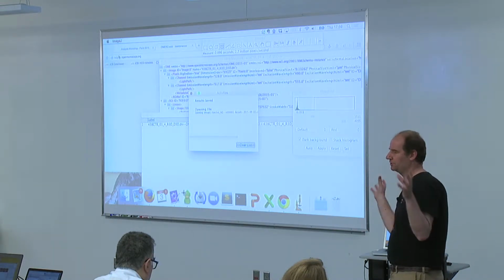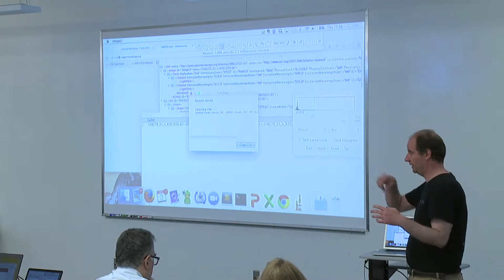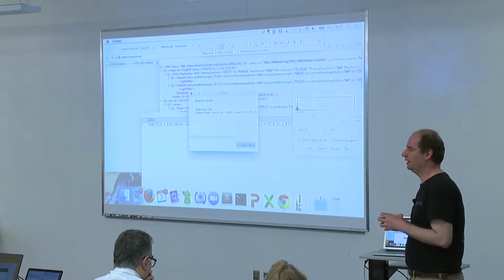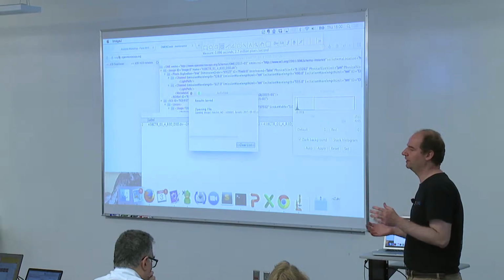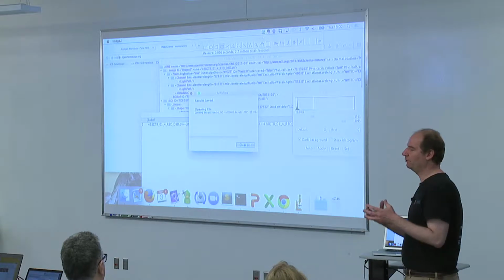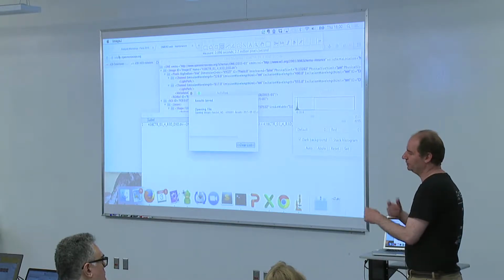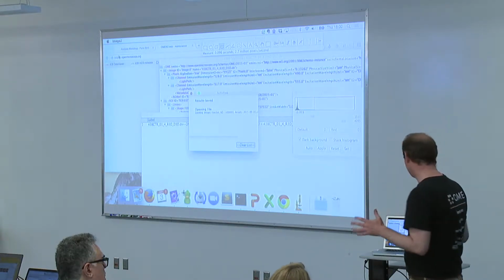And Balaji Ramalingam, who is a developer in our group in Dundee, drew it further, and he has plugins. These are basically MATLAB scripts which allow you to adjust the acquisition parameters as you go. As the images are coming into OMERO, you can see that they need, I don't know, more exposure, whatever. You can adjust it in the script and go once more, see them again in OMERO, which means you can, using OMERO Web, actually have the images on the internet as you are acquiring them, which gives you much bigger power to adjust the acquisition as you go. Okay, but again, it's just not ready.